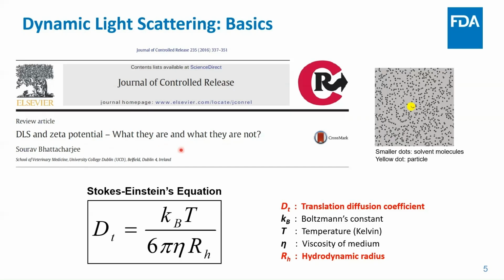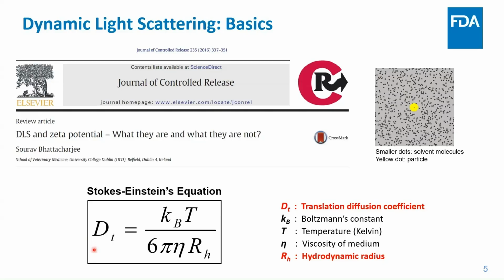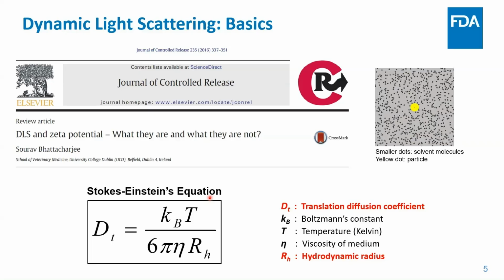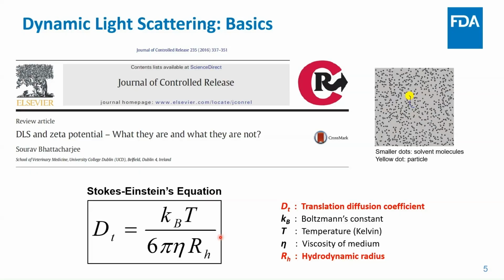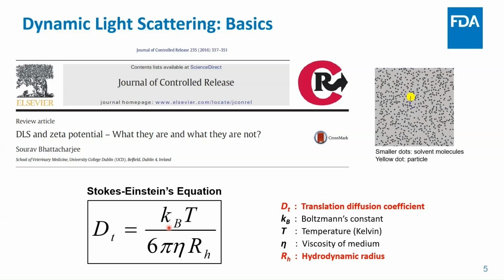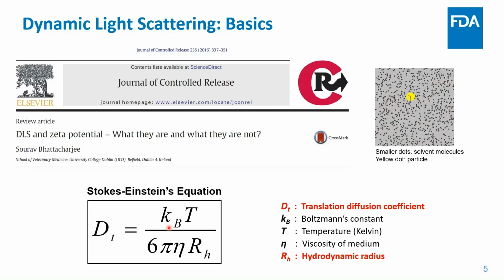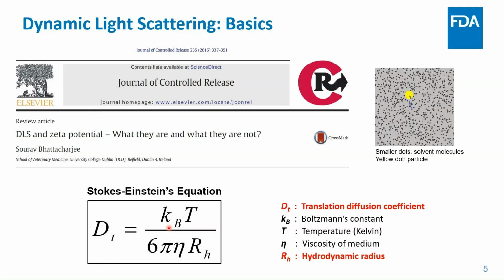And so this is really the fundamental thing behind DLS: you're measuring the translational diffusion coefficient and applying the Stokes-Einstein equation, which is based on the frictional drag for an equivalent hydrodynamic sphere. So when you say you're measuring the particle size by DLS, you're actually calculating the particle size from a measured diffusion coefficient. That's usually the number one thing when you're thinking about what is actually being measured here: scattering intensity and diffusion coefficient, and not necessarily size.